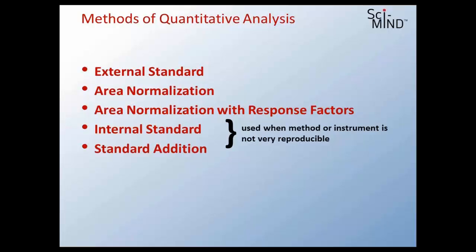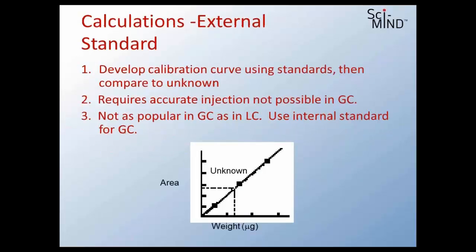Again, I'm grateful to the folks that brought up HPLC, because with the good instrumentation we have today, I think that's also causing us to rethink a little bit about how we do our calibration and our quantitative analysis. Seeing a lot less need for things like internal standards today. We can actually get, the way the spectroscopists can, back to traditional calibration curves.